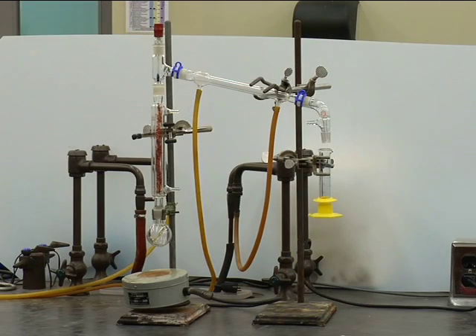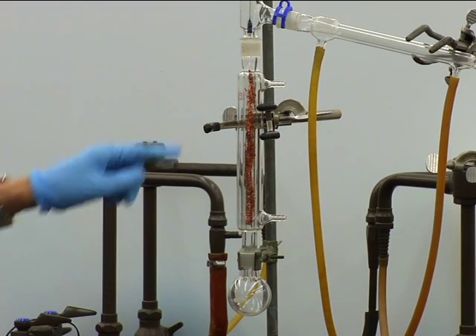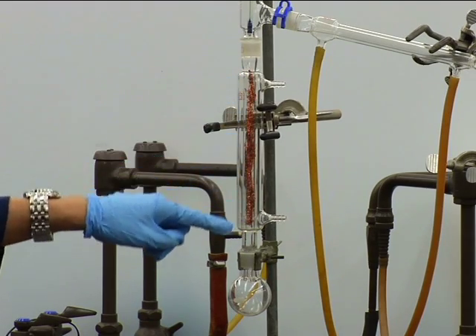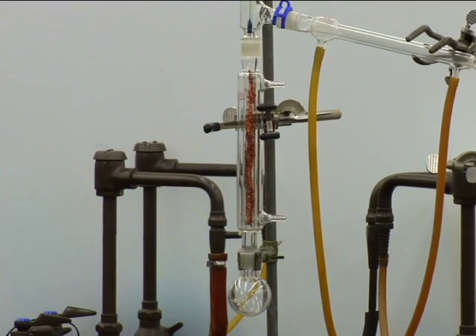The purpose of a fractional distillation is to separate a mixture of liquids based on their characteristic boiling ranges. It differs from a simple distillation in that a vertical fractionating column is used. This column promotes multiple successive vaporization-condensation cycles to enrich each component to better achieve purification.